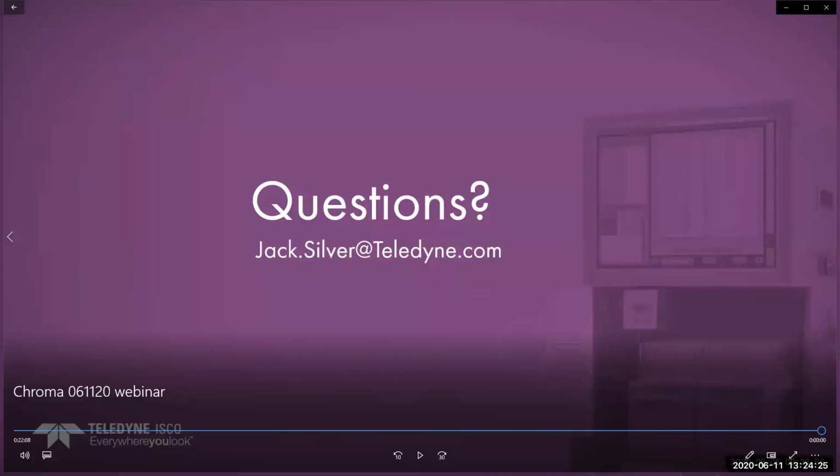Okay, we have a question: will these techniques work for HILIC? And the answer is yes, it will. We can calculate gradients that way, and you do have to buffer your solvents the same way that you would for C18.